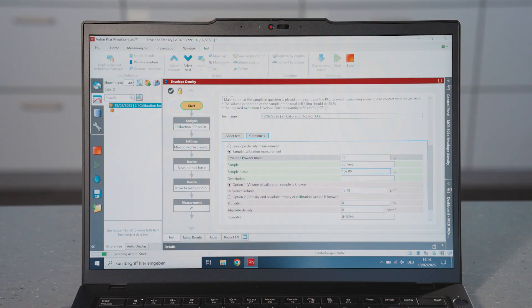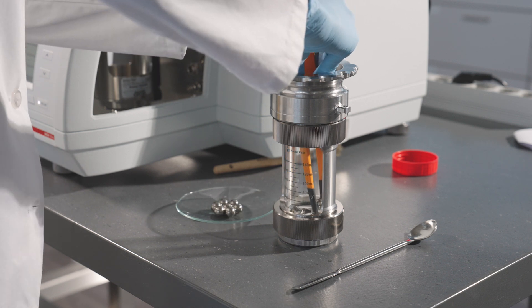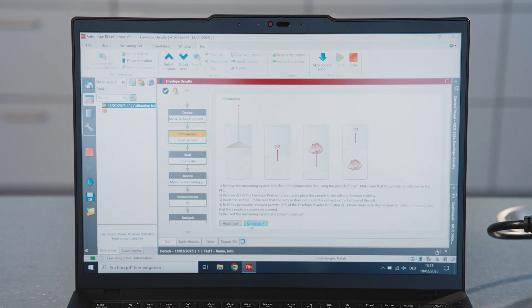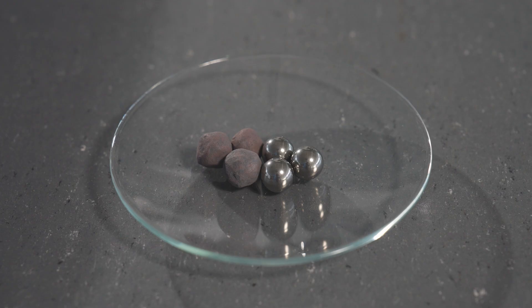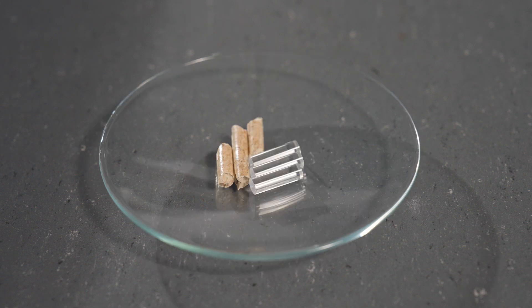Start the measurement in the same sequence as standard sample measurements. Insert the calibration sample and finalize the measurement by pressing Continue. The calibration sample must be made of the same material and have the same size and shape as the sample in question.